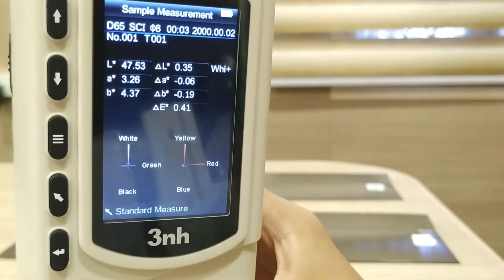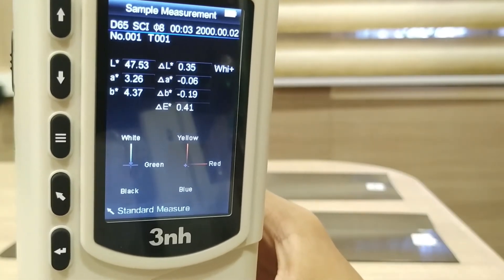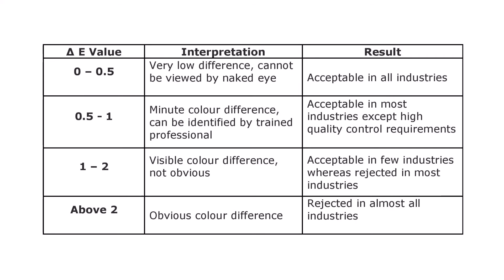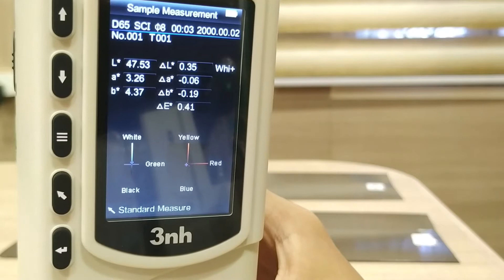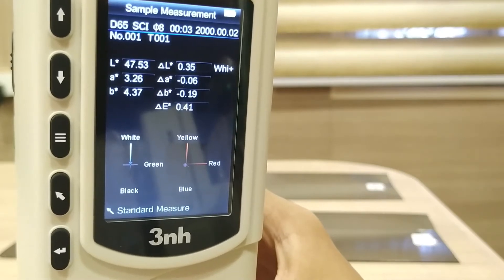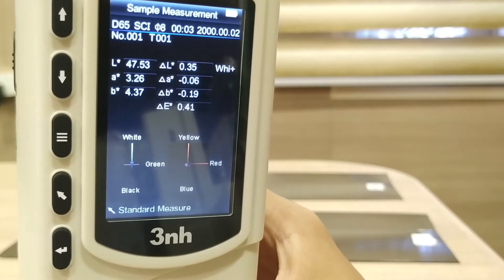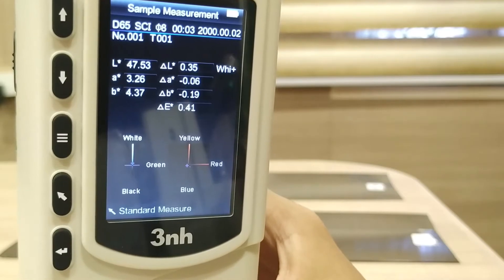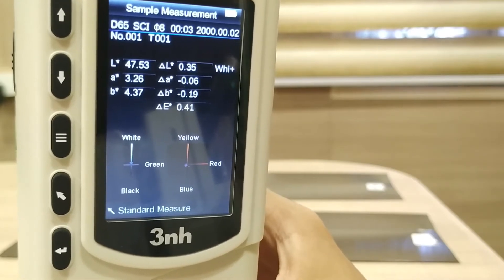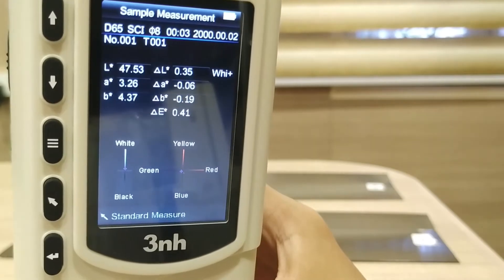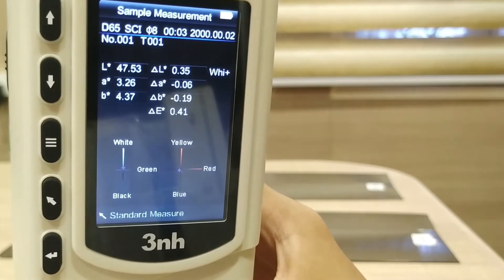Here is the table for reference. As you can see, a delta value of 0.41 is said to be a very low difference and is accepted in all industries. This means that our sample has passed the color test.